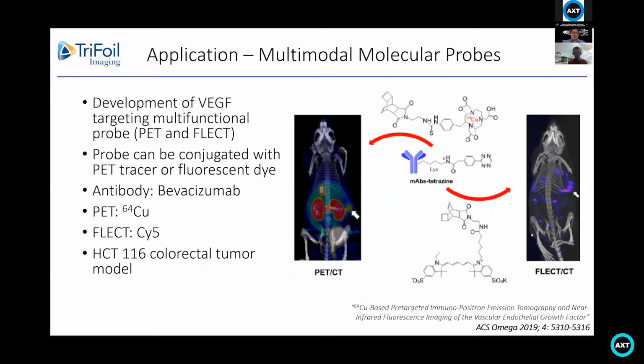And so here is a really good example, and here's something that we're going to be working on with our collaborators at Johns Hopkins, doing similar types of studies in different application areas, where using an optical method can give you a lot of a priori, or really good information, before you move into a very expensive PET or a PET radiotracer.